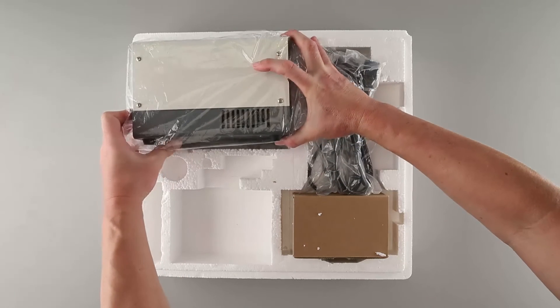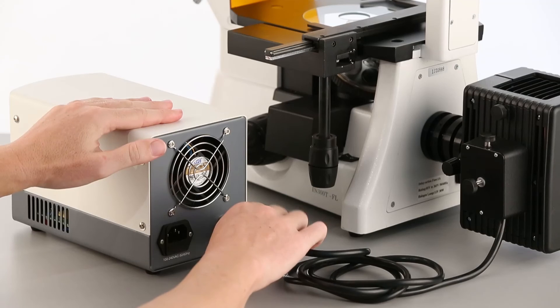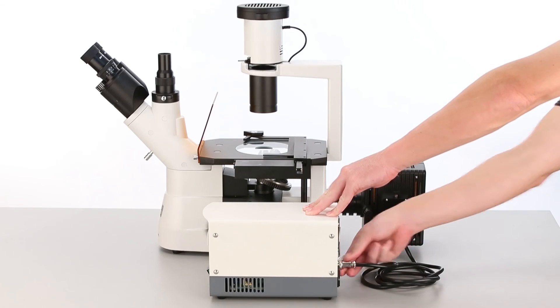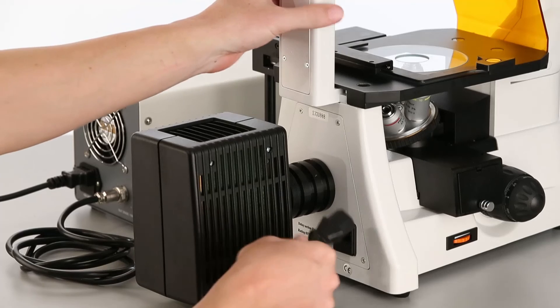Now we'll unpack the power supply for the episcopic lamp. The episcopic lamp has an attached cable with a 3-pin connector, which is inserted into the power supply. Next, we'll attach an AC cord to the power supply and the body.